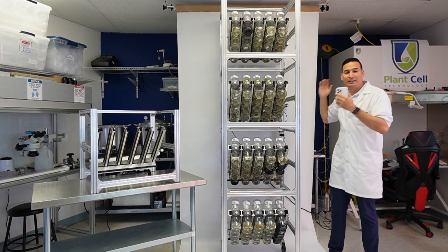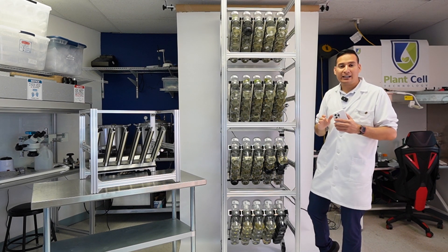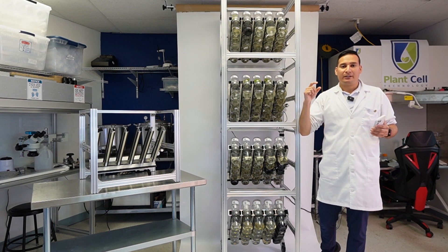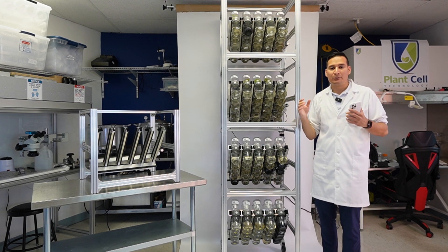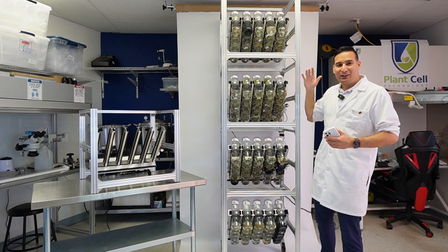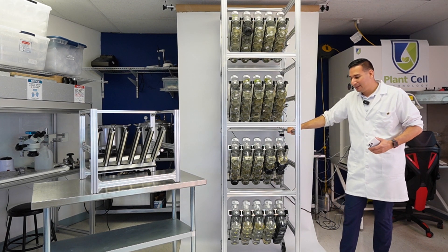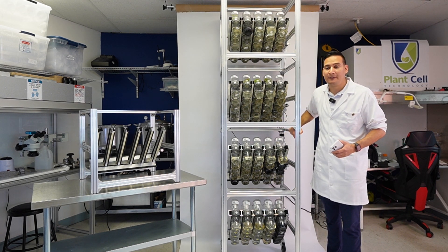This is the beauty of the BioTill — it is very space efficient. I've never seen a temporary immersion bioreactor system as space efficient as the BioTill. More traditional systems use tubes with air compressors and filters, and they take a lot more space. This unit is less than half a meter on each side, so it takes up very little floor space.